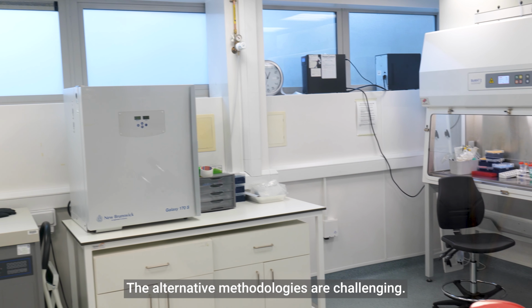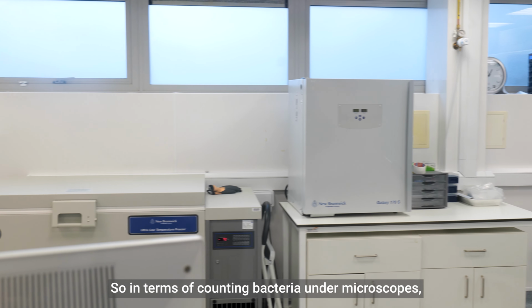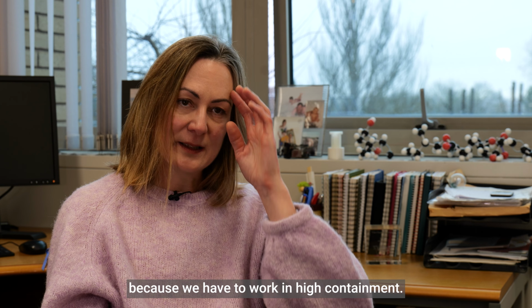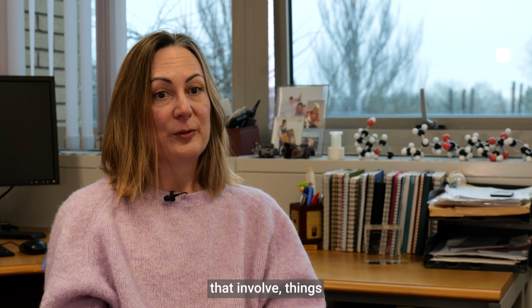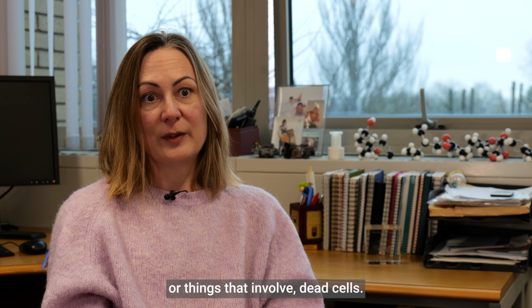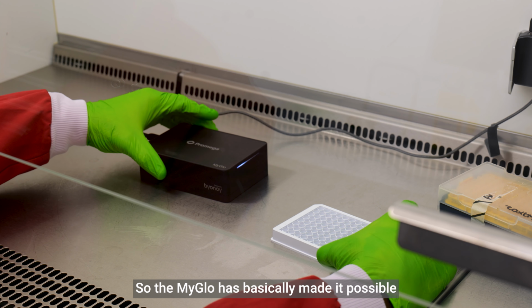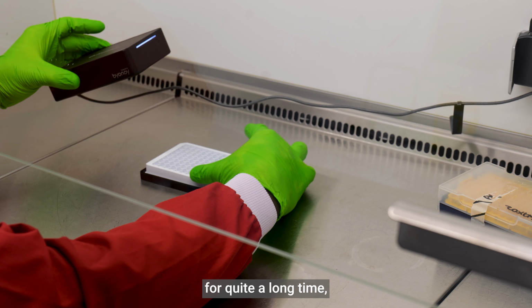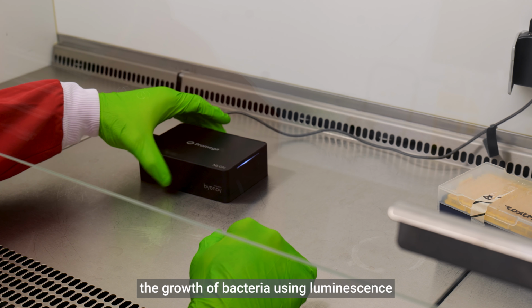The alternative methodologies are challenging. In terms of counting bacteria under microscopes, we were limited to that because we have to work in high containment. So we were essentially using assays that involve things that we can work on inside the cabinet or things that involve dead cells. So the MyGlo has basically made it possible to do assays which have been around for quite a long time, where you can measure the growth of bacteria using luminescence.